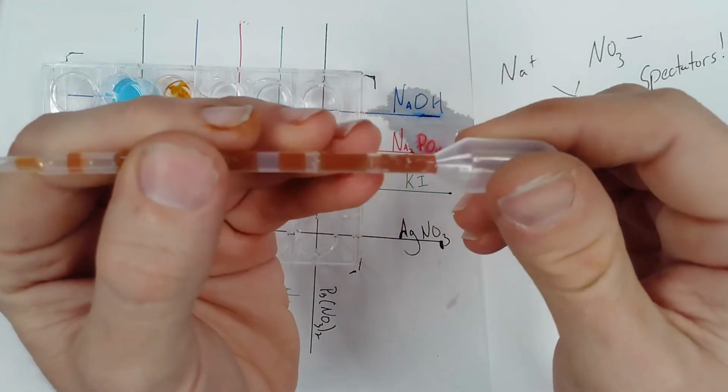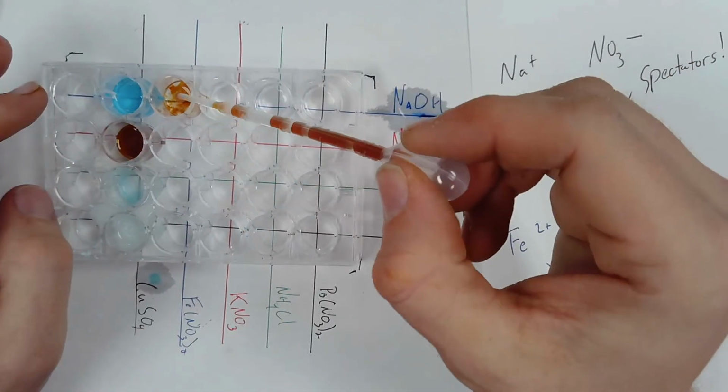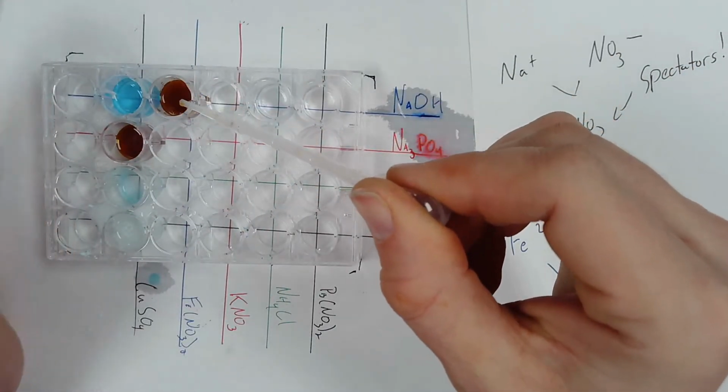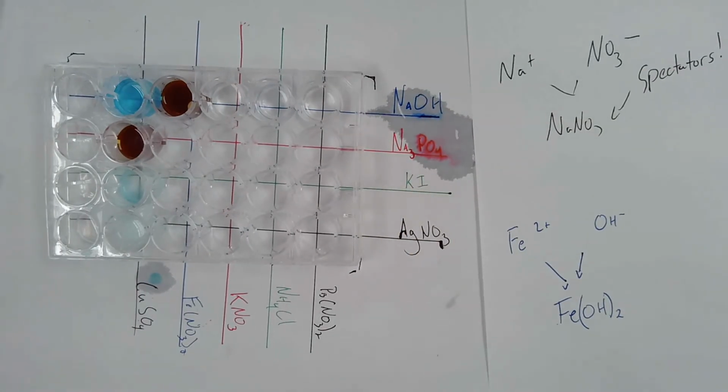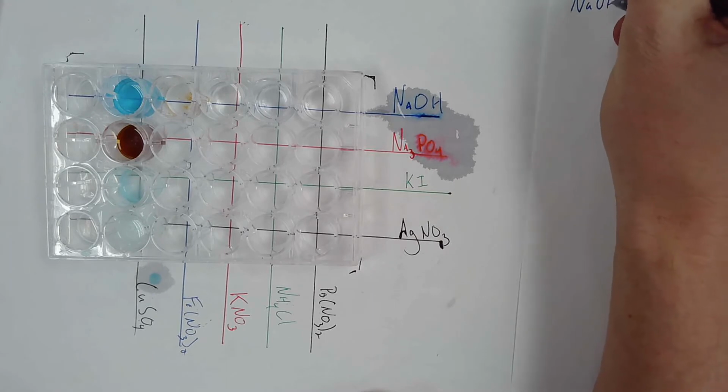I don't know if that's really obvious to you, but here in person I can see little grains of it. Again, this is one of those things where if I spun it down, well, I guess it's better to show than to tell. You might be able to hear that in the background when I spin it down really quickly. Let's look at this last reaction.